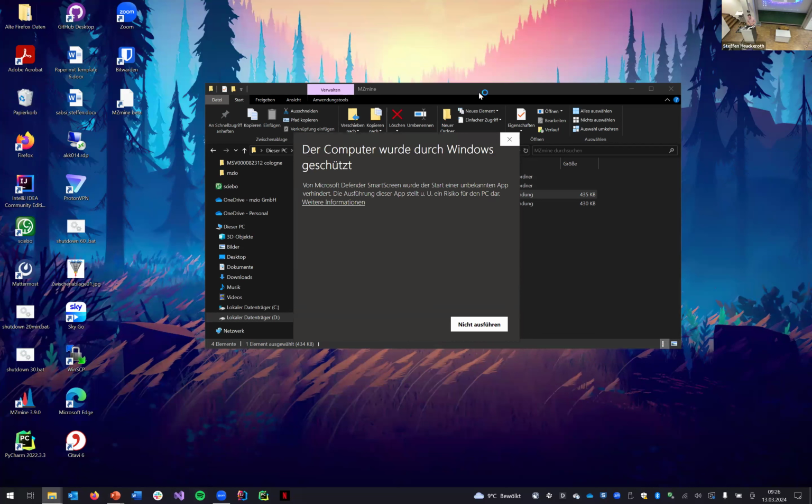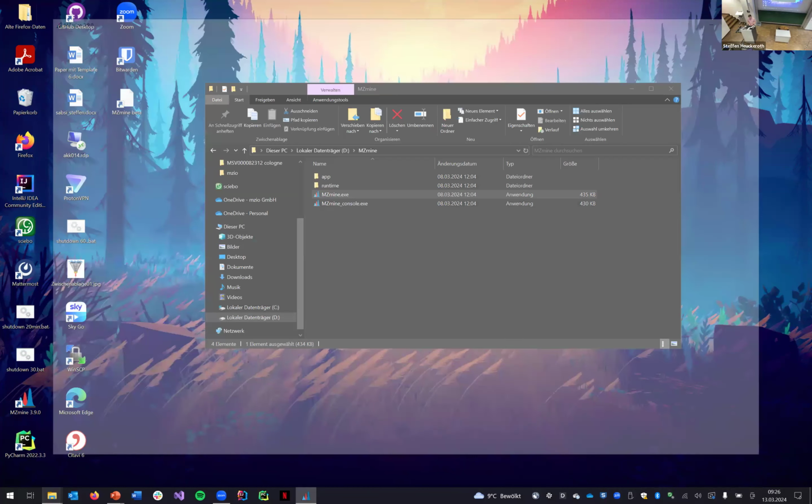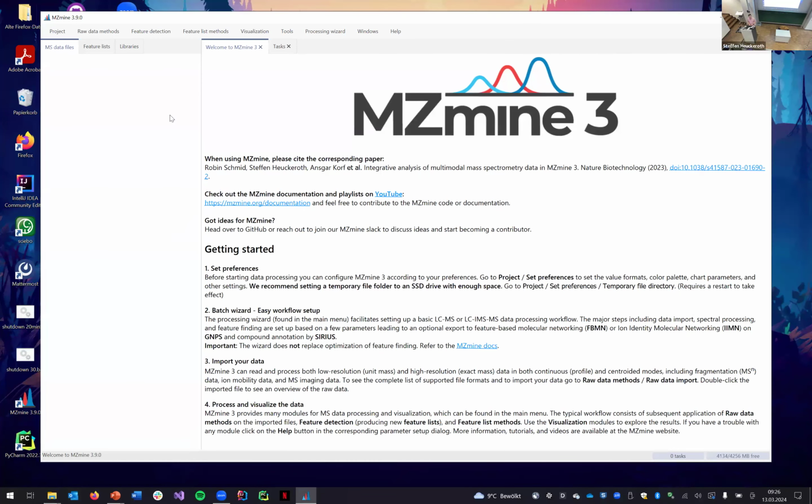And if you get this message on Windows, you click on more information and then say run anyway. Then it might take a couple of seconds to open the window. Does everybody have MZmine open?